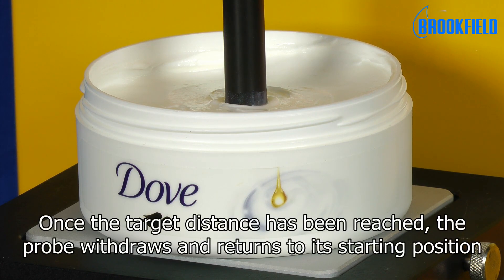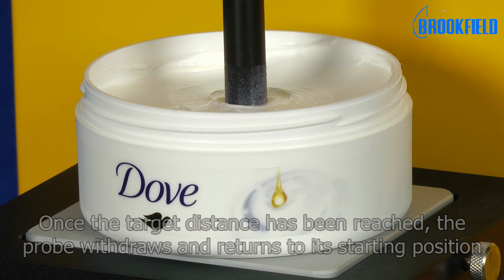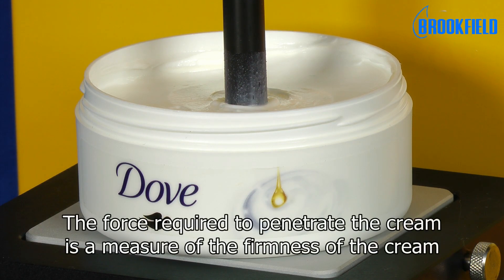Once the target distance has been reached, the probe withdraws and returns to its starting position. The force required to penetrate the cream is a measure of the firmness of the cream.